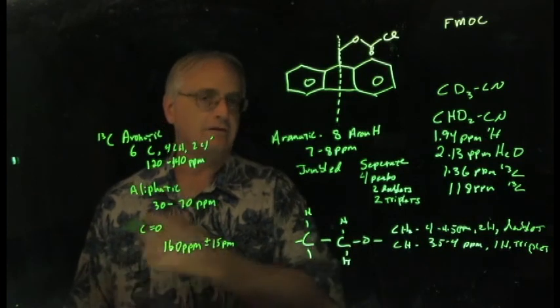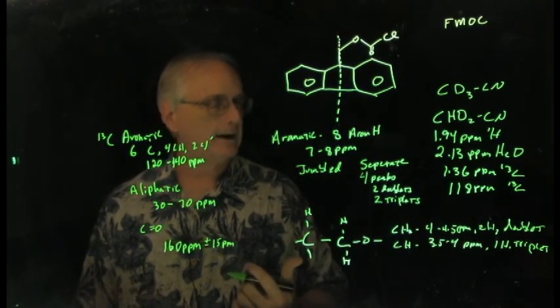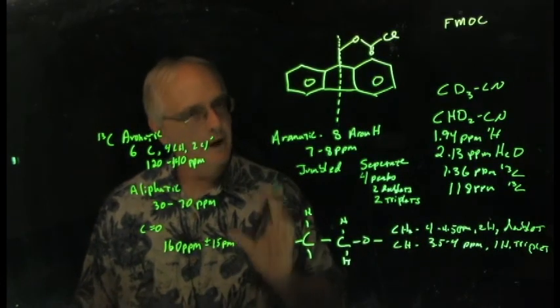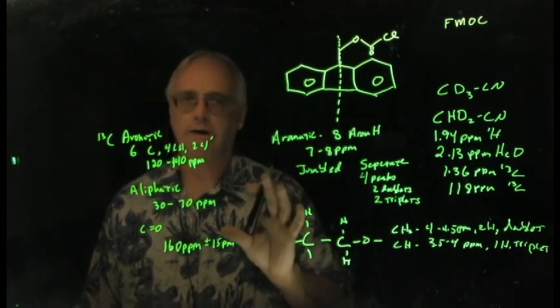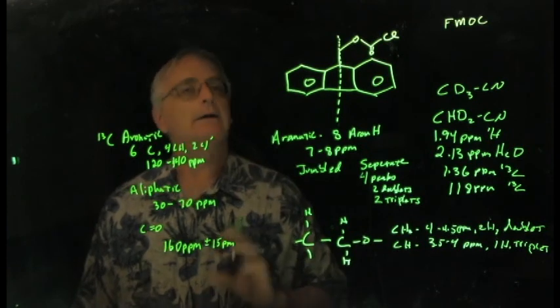Solvents from previous steps will often show up unless you are rigorous in your drying. Fourth, chromatography solvents will show up sometimes. So just be on the lookout for these things out there. Check your starting materials. It can save you so much hassle in the long run.